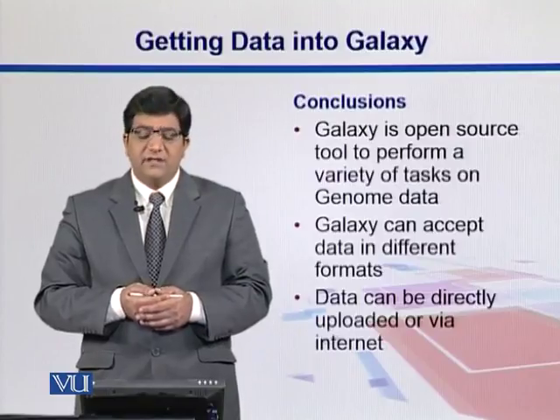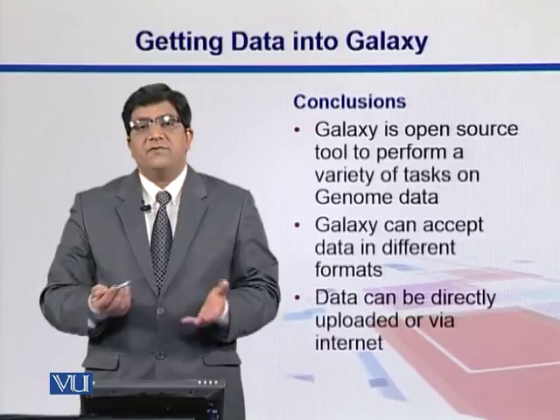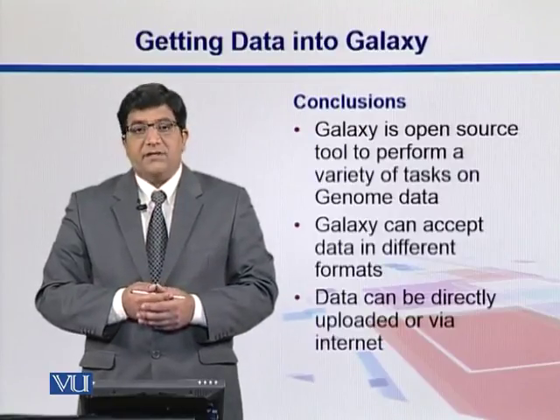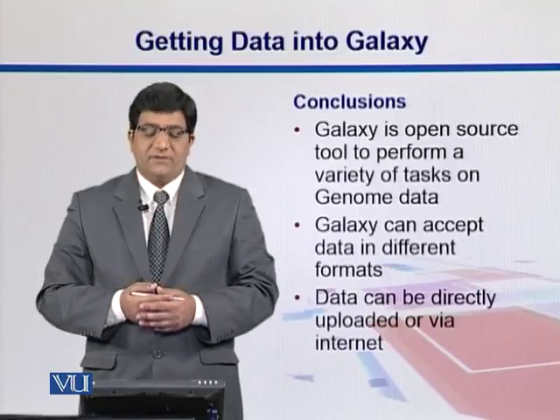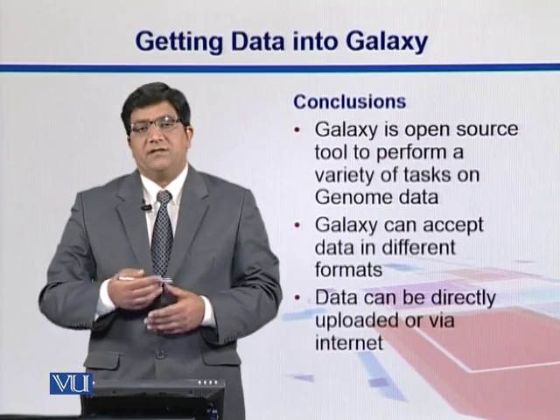So far what we have seen is that Galaxy is an open source tool to perform a variety of tasks on genome data, and it can accept data in different formats, and data can be directly uploaded via the internet also.